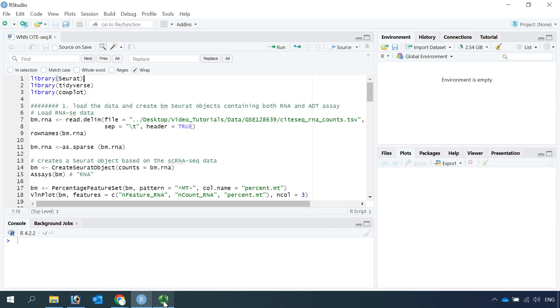Hi everyone! Welcome back to my video tutorial for multi-modal data analysis. Today I'm going to demonstrate the analysis for joint RNA-seq and antibody-derived tags (ADT) analysis using weighted nearest neighbor analysis.